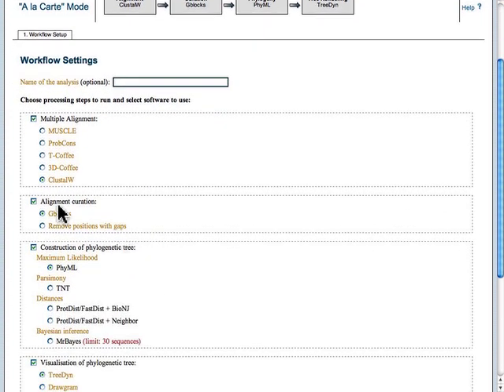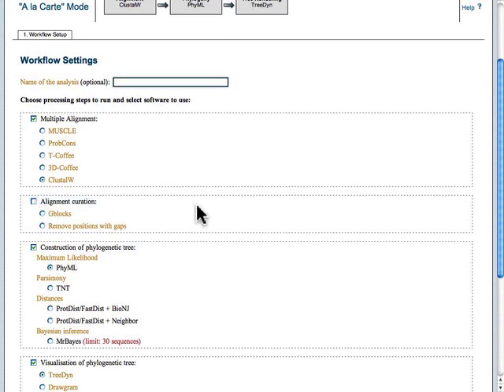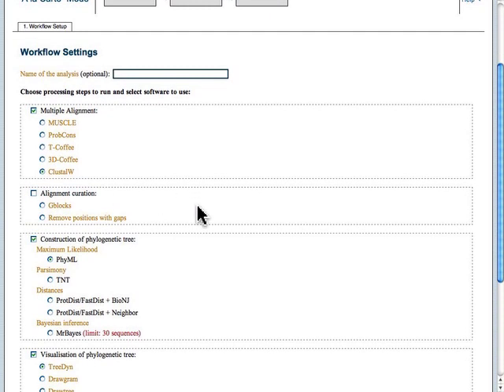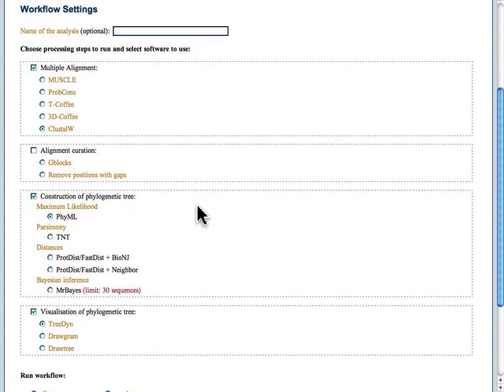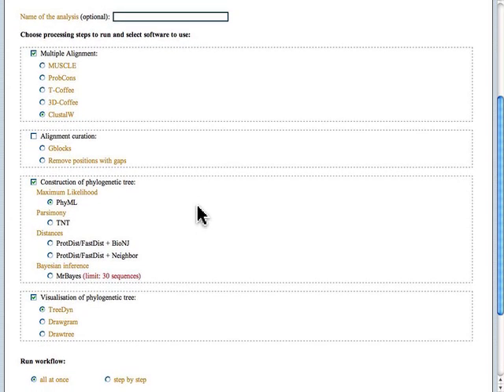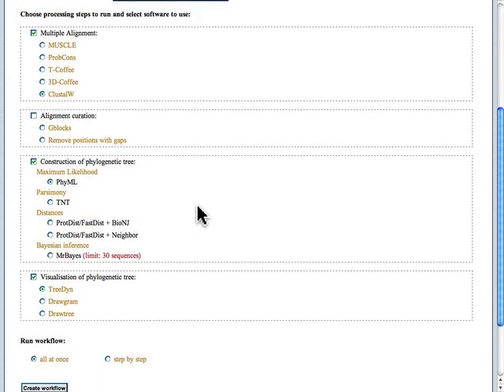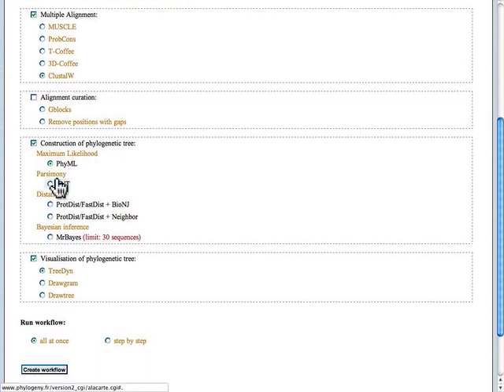The alignment curation step is something that I'm going to have us turn off, because these sequences are quite similar to each other. We should not need to manually curate those alignments at all.